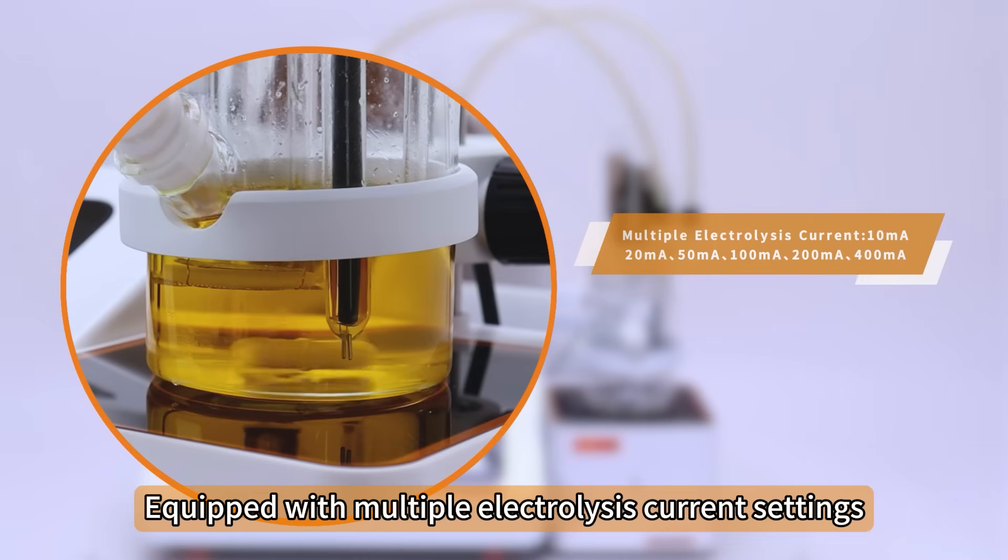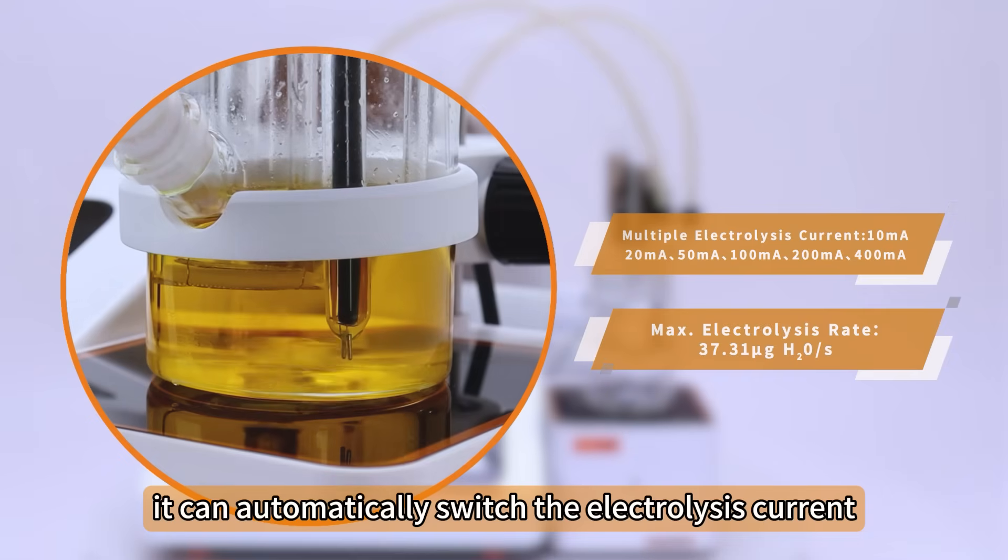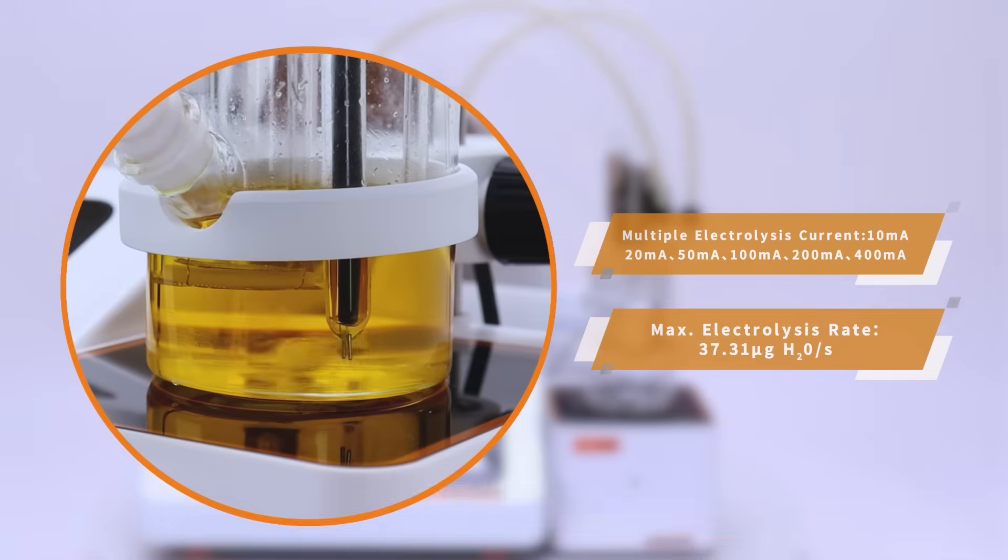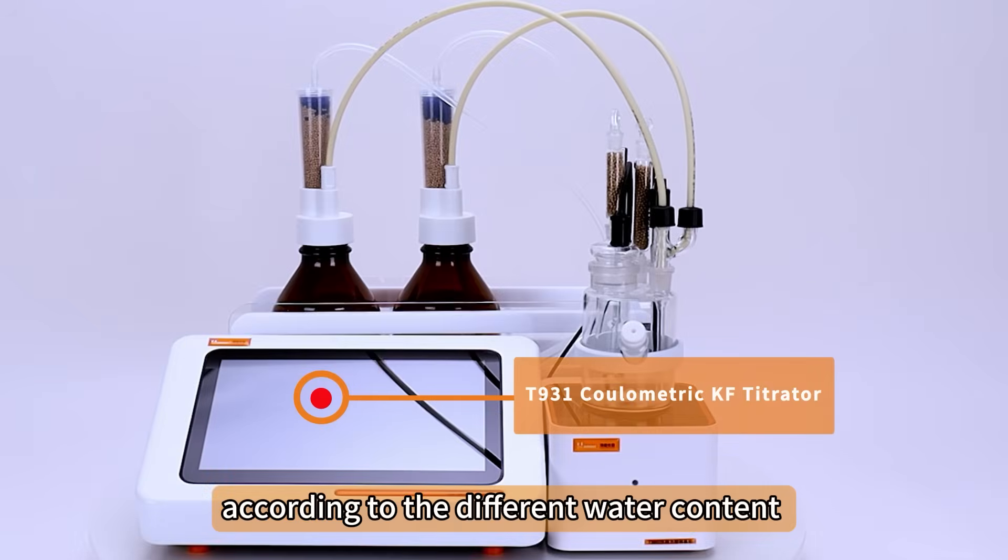Equipped with multiple electrolysis current settings, it can automatically switch the electrolysis current according to the different water content.